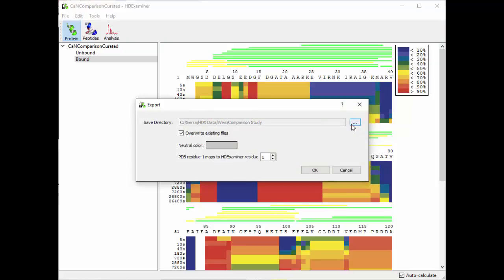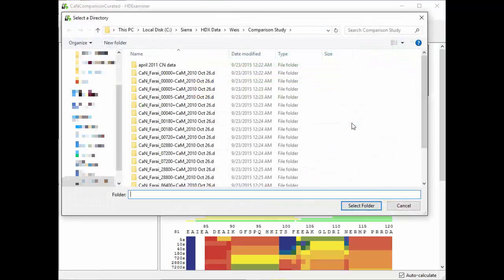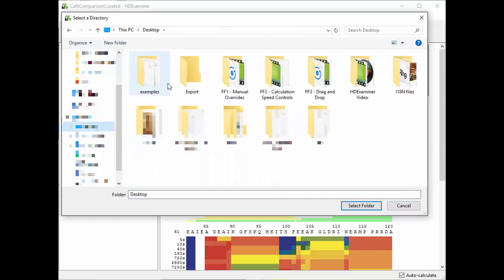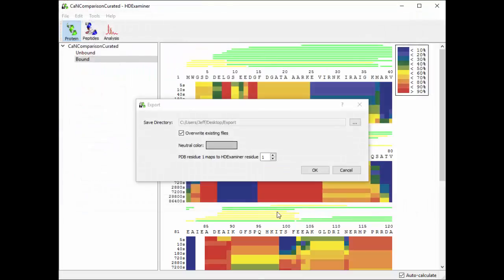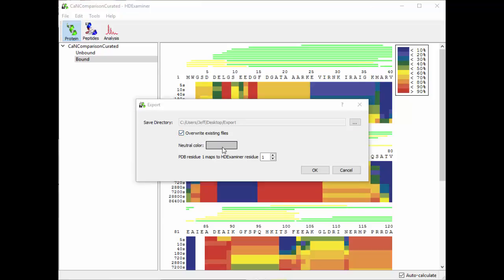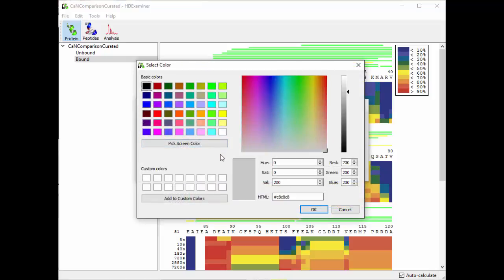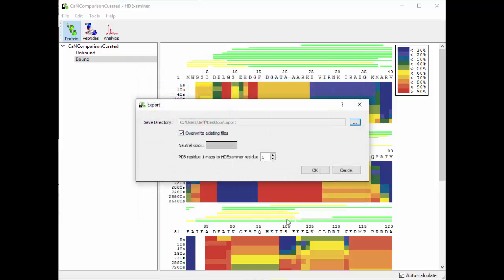There are several things here. There's a save directory and if you click on this you can tell it where you want to save, so I'm going to put it in this export folder. You can tell it whether to overwrite existing files or not. You can tell HD Examiner what you want the neutral color to be, meaning the color that doesn't have any data associated with it. So by default it's just a nice gray.